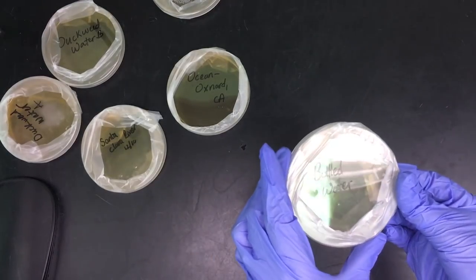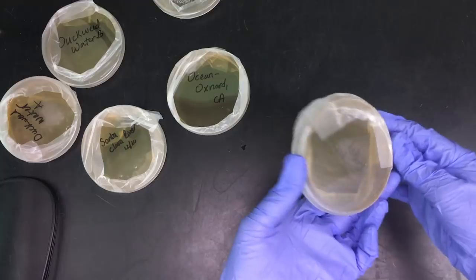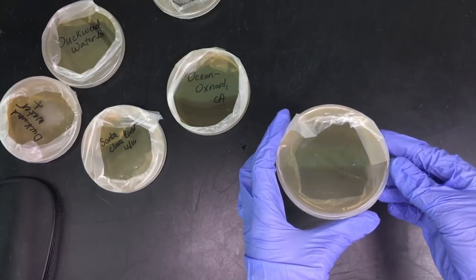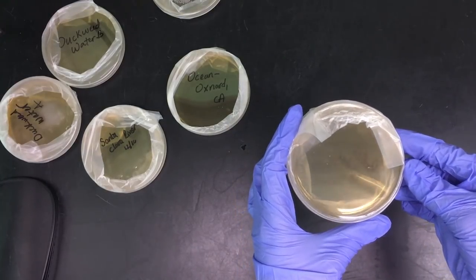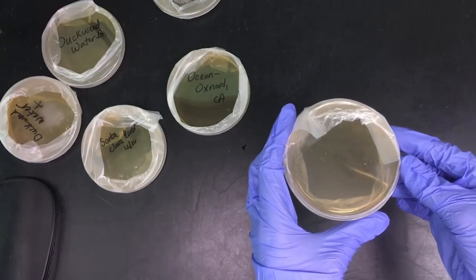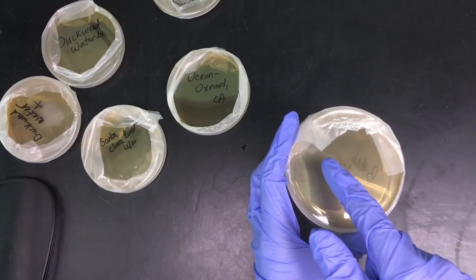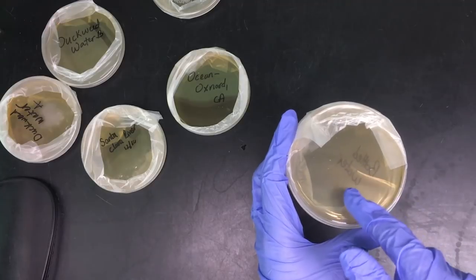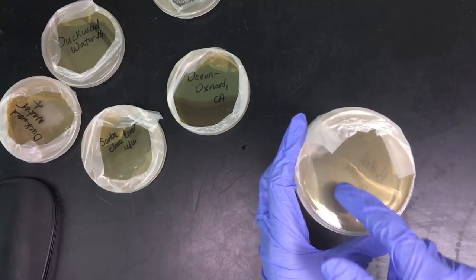Our bottled water sample, here on the bottled water sample we are negative for fecal coliform, so that's excellent. Also there are a couple of specks, these are not bacteria colonies, this was actually clumps of agar, so this is also negative of fecal coliform.